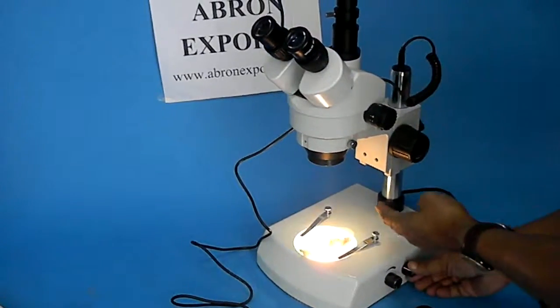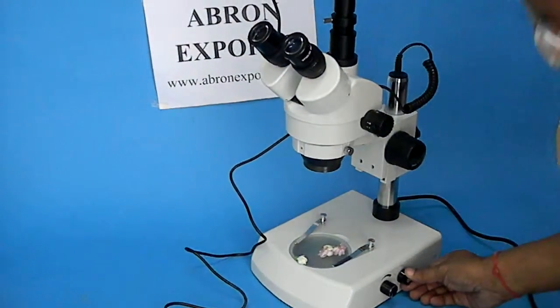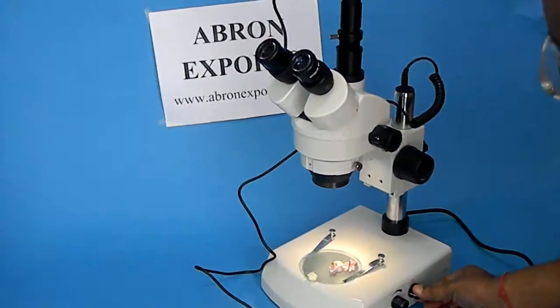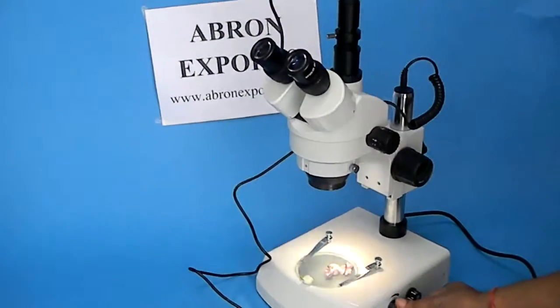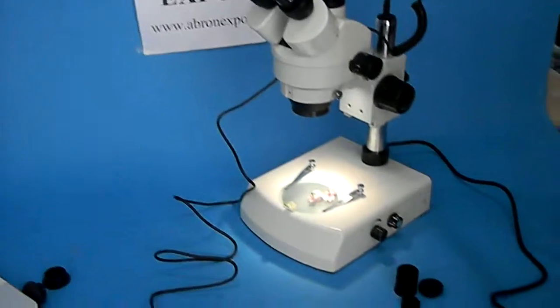This is bottom light. Top light also. And variable intensity control is there. Thank you very much.